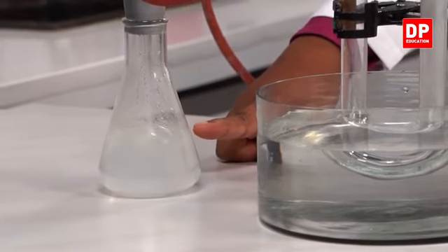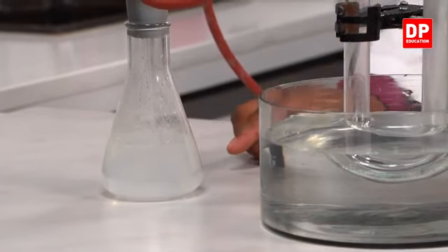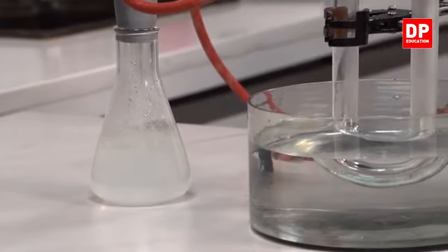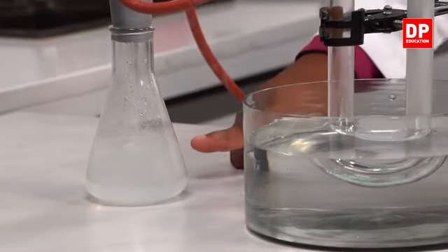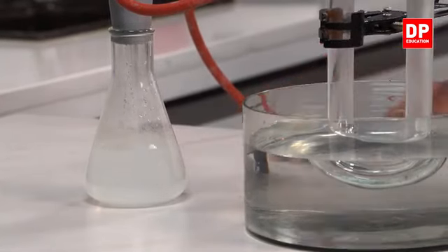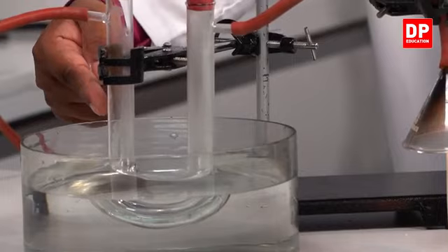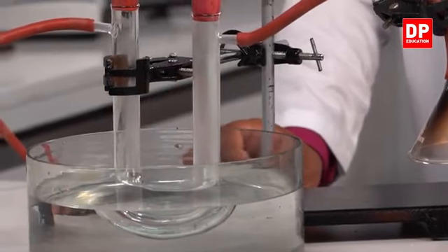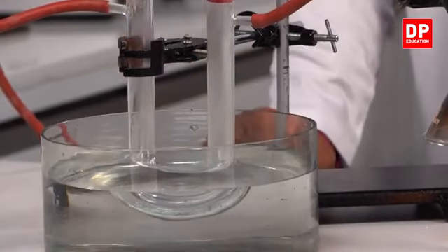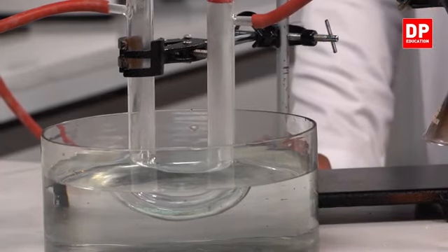Can you see? Now when I was conducting the experiment, initially when this chemical was in the system, the color was like the color of water. Now it's been turned into a milky white color. Here you can observe it, see. And here also we can see that gradually the copper sulfate crystals are getting converted into light blue color. See, gradually it's getting converted into light blue color. So we'll give out some more time and let's observe.